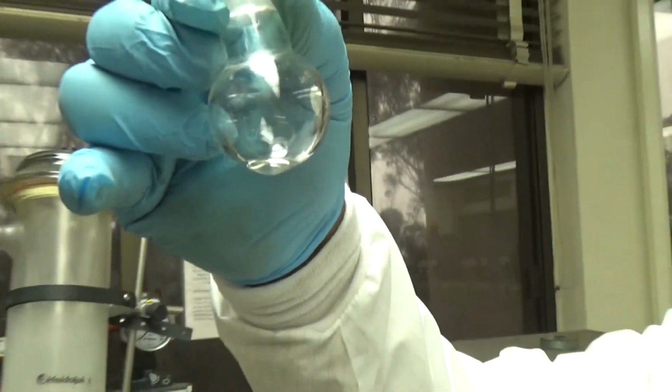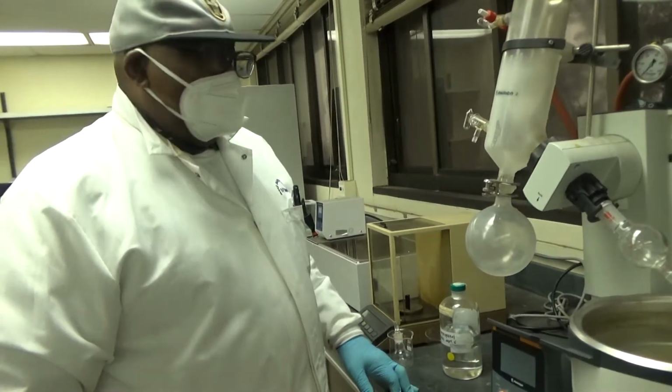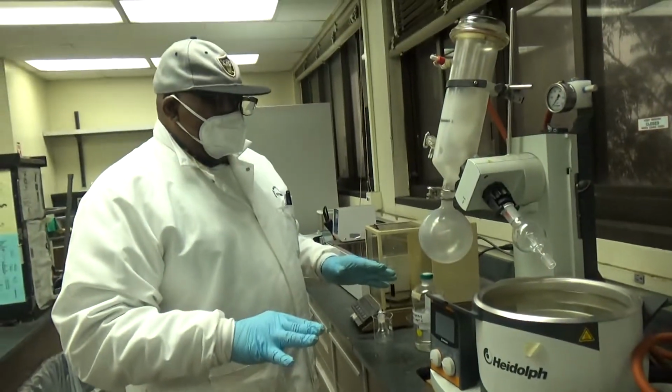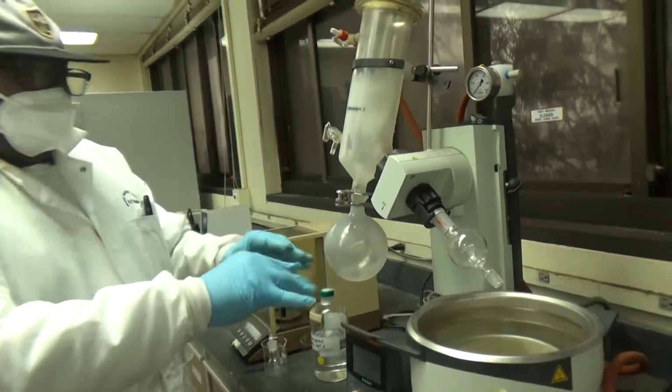And here is the original. Cool. That's your bottom, final product, kind of a liquidy eugenol, a little yellow. Yeah. So whenever you are done with your evaporation, you also need to clean.